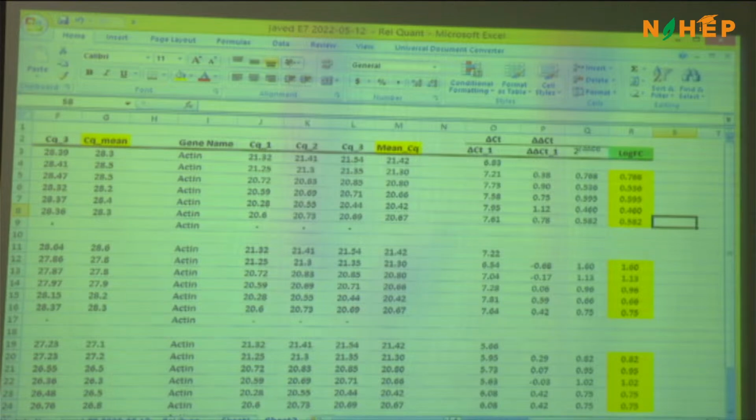But in the early stage, ma'am, if we go with the formula, it comes. No, one minute. This is both your control sample and treated sample. The point of comparison is inoculated and non-inoculated, not with the reference. The reference has to be used only to normalize the data. Normalizing both. That's it. Only for normalization.